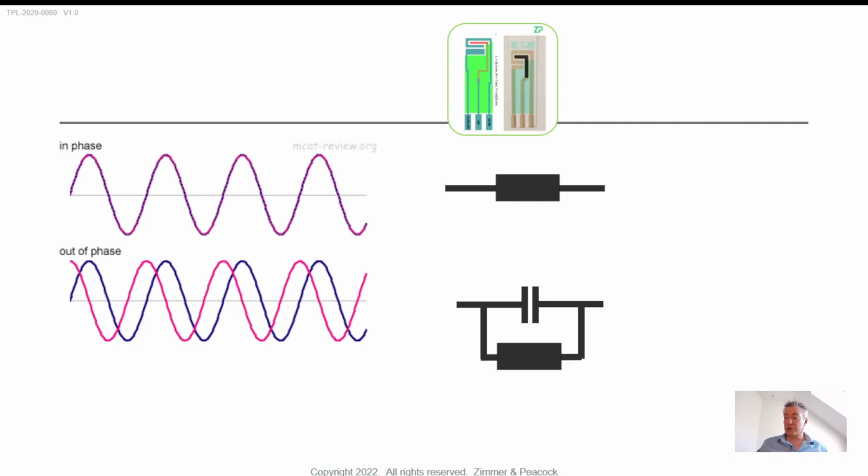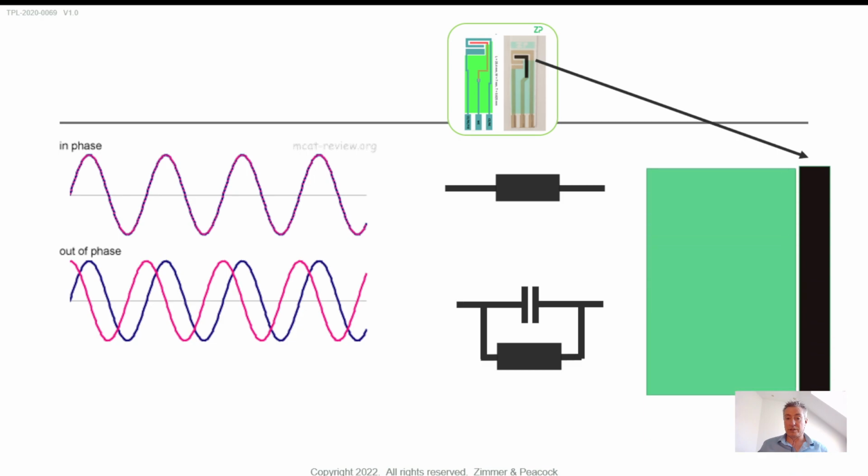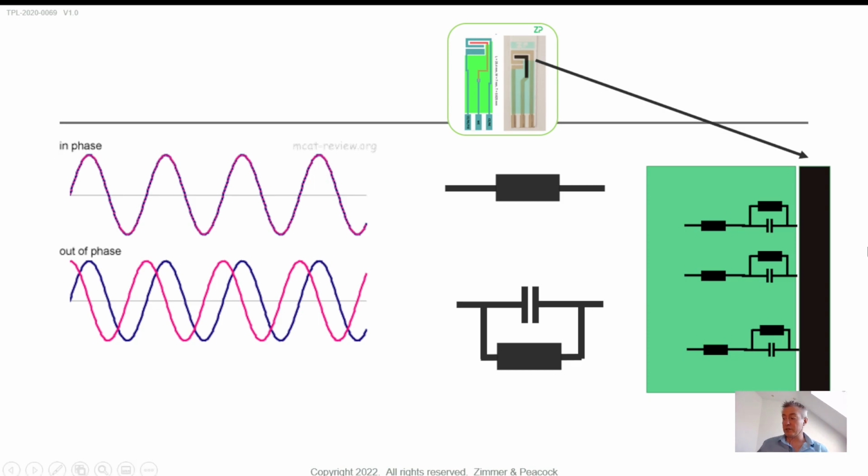So we have our electrode, and when it's in solution, so for example, I put a solution here, the surface is acting actually like a lot of tiny little capacitive and resistive circuits. I have a resistor here, I have a resistor here, and I have a capacitor here. They call this sort of Randles circuit, and it's a model that is not a bad starting point for describing the surface. Now I'm going to go back to a chemistry model.